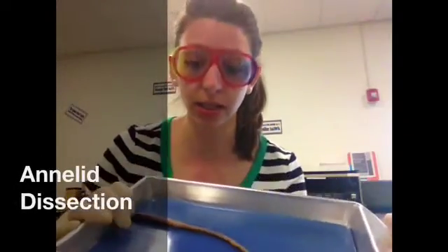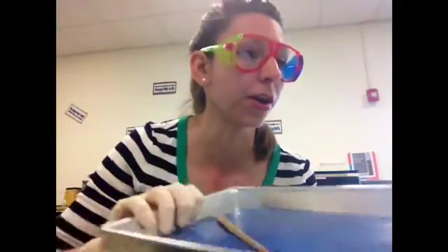Now we're going to be looking at our annelid dissection. We'll need our dissecting pan, our annelid or earthworm that has been preserved. Please don't do this on a live one. You'll also need gloves, forceps, scalpel, and our dissecting probes. All right, let's get started.